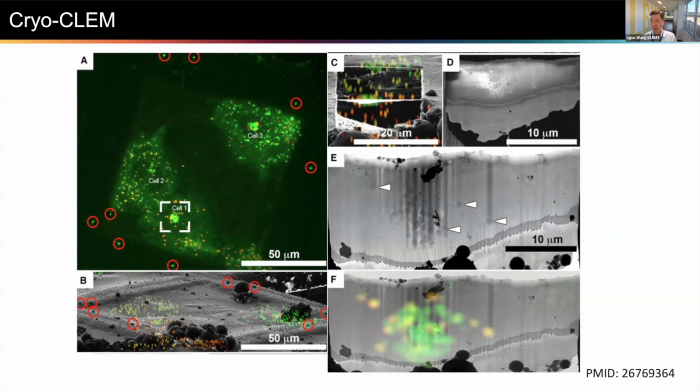The next question is, for the missing wedge effect, why can't we tilt from positive 90 degrees to minus 90 degrees all the way? Oh, it's because if you look at the microscope, it's sort of tall, right? The beam is coming from top to bottom, and your specimen cannot physically be imaged at exactly the same angle where the beam is coming down. So that's why it cannot be imaged from 90 degrees to minus 90.